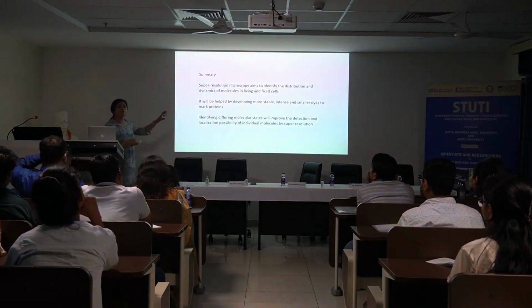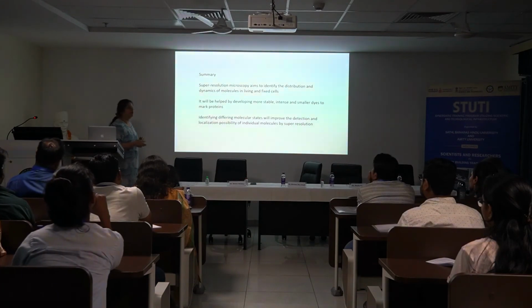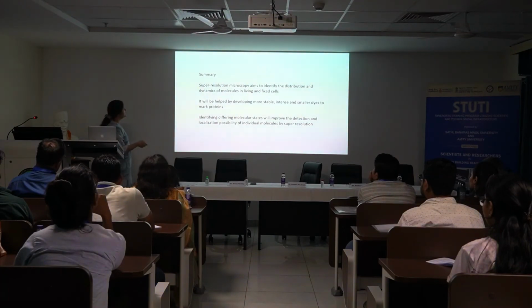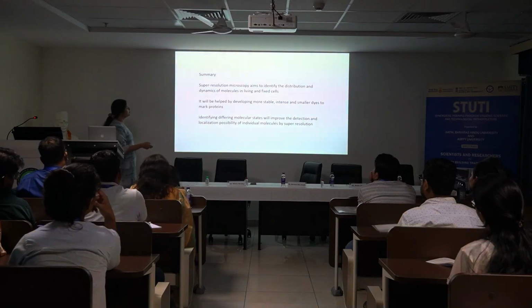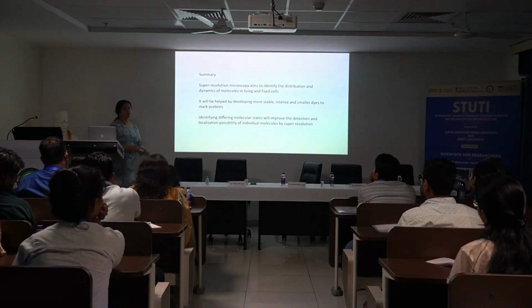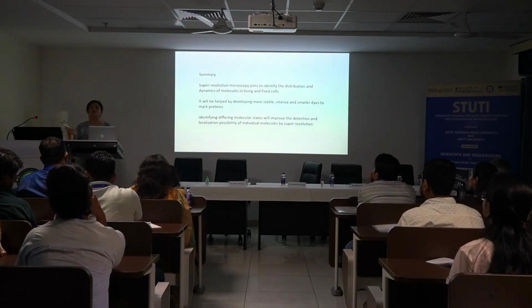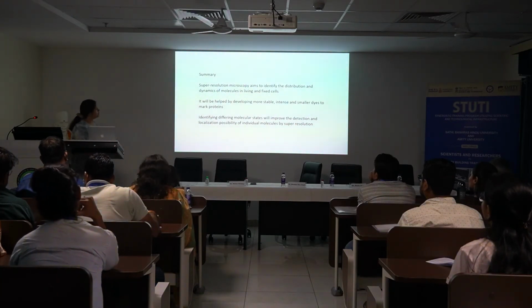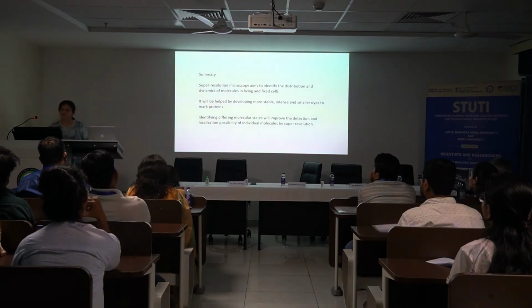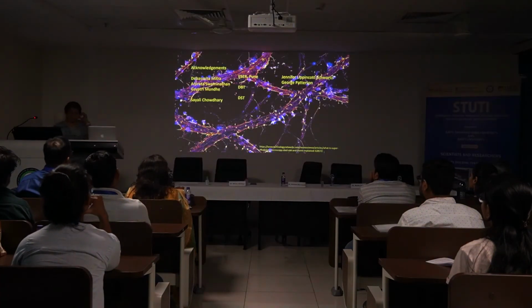And let's say use that in the STED mode. Then we can essentially use that for a super resolution method, right? So essentially identifying different molecular states by knowing the chemistry of the molecules will improve the detection and the localization possibility for the use of all of these molecules in super resolution, right? So these three take-home messages come from studying a little bit the super resolution system.